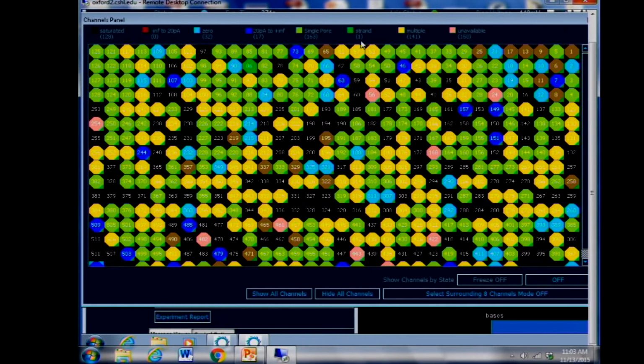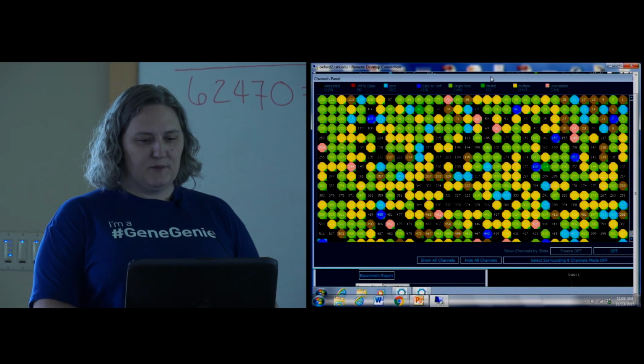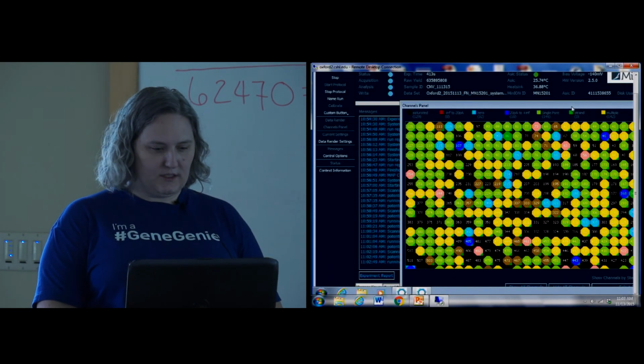Now, this is very possibly due to the fact that in this run, the average size of DNA is about 550 base pairs long. So the nanograms of DNA material present is very low, although the molar concentration is similar to what we would expect from a larger fragment system. So chances are the diffusion, the movement, the ability of the tether to capture the DNA is lower than ideal. And so that's only capturing a few strands at a time, which is what we expected. So that's fine. We're going to wait for it to finish its process, then I'll show you what the group segregation looks like.